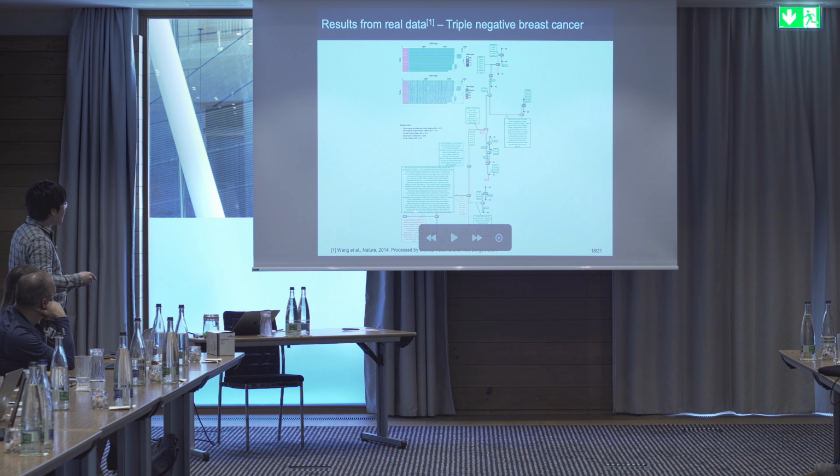For this data set, we observe a lot of other types of mutation events, which are not single mutations. For example, here we have double mutation, here we have some single back mutation, and we also observe some parallel evolution. This is actually one more feature of our method, that we can categorize different mutation events into different types. Also for this data set, we observe a lot of double mutant genotypes compared to the previous one.